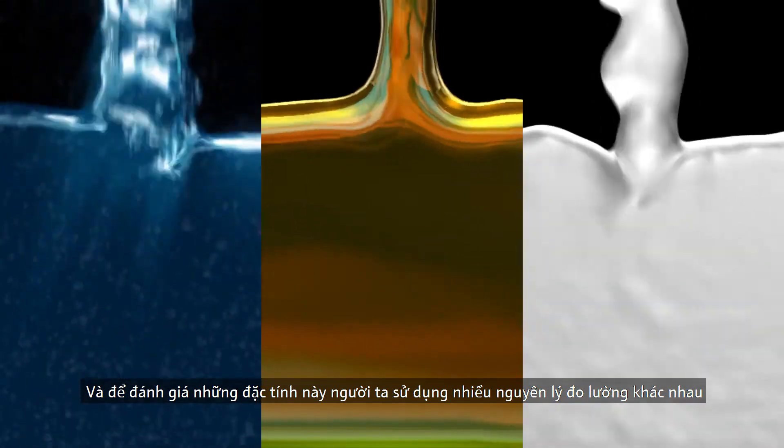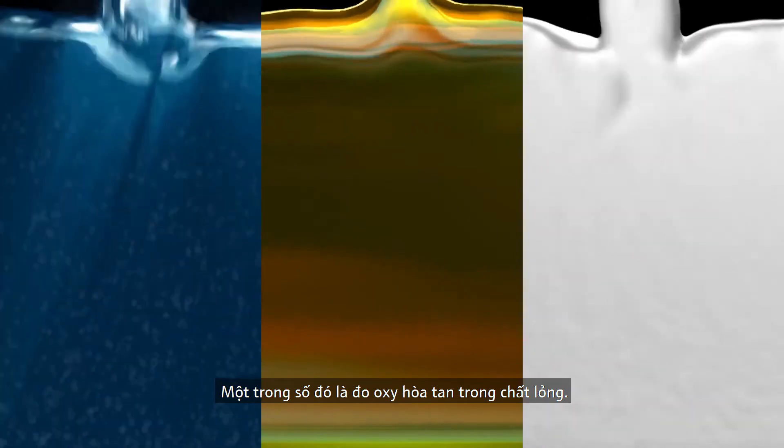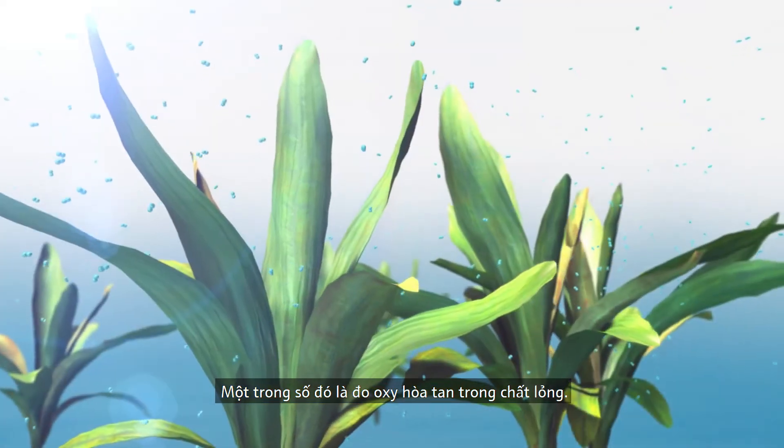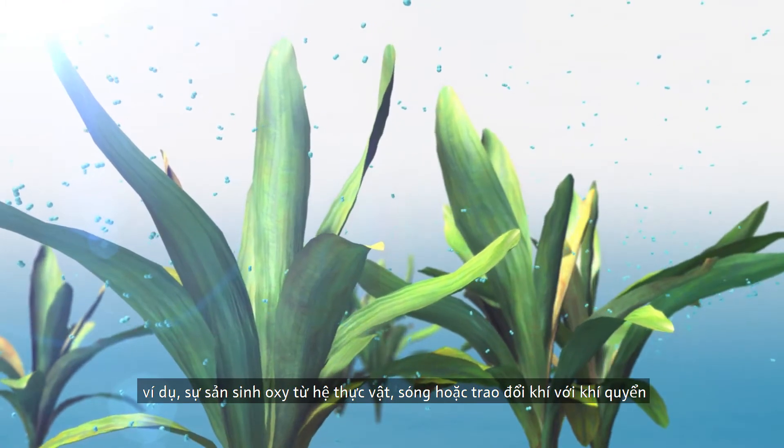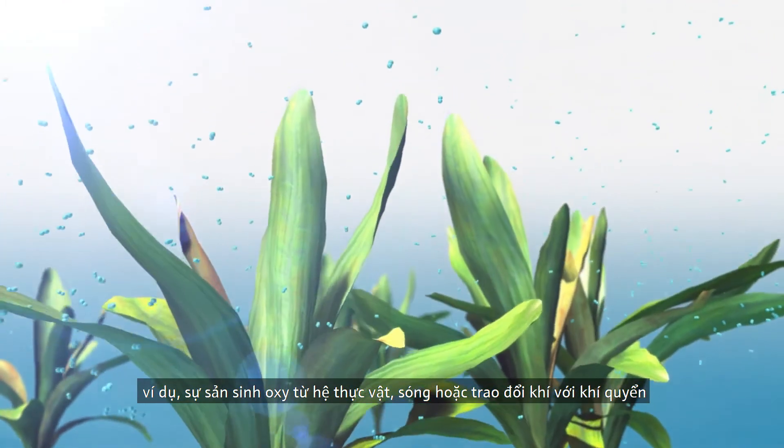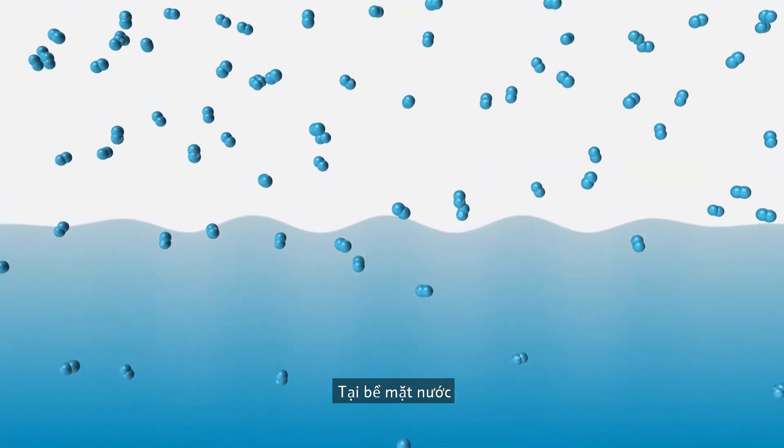One of these principles is the measurement of dissolved oxygen in liquids. Oxygen penetrates liquids in different ways, for example via oxygen-producing plants, waves, or gas exchange with the atmosphere at the water surface.